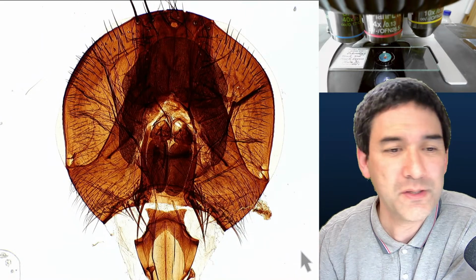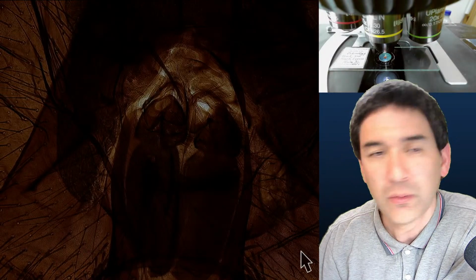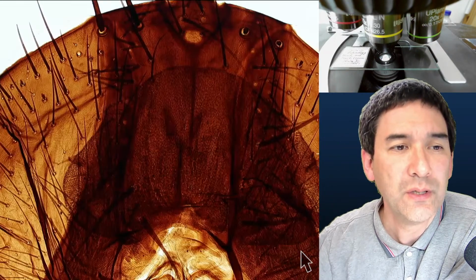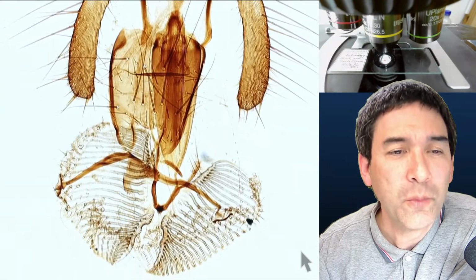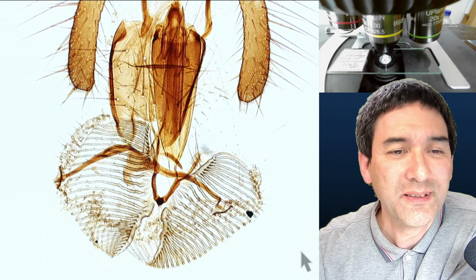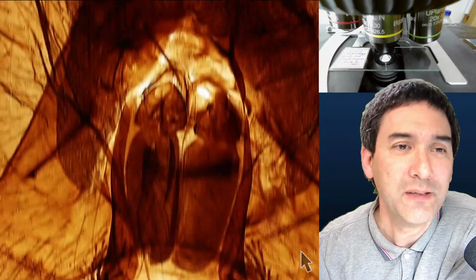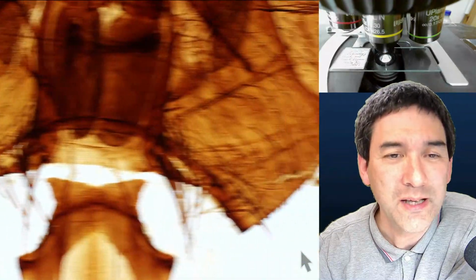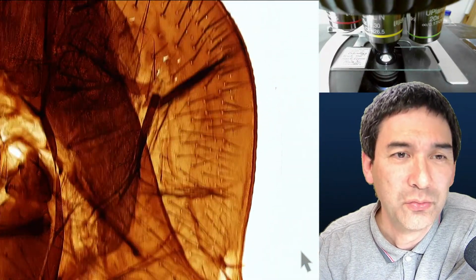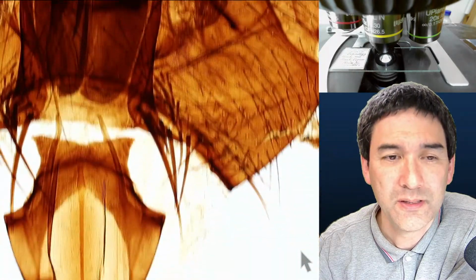Yeah, we can actually go a little bit up with the magnification, and I will. So this is now with a condenser. Look, it always fascinates me, the enormous complexity and intricacies of this. That's one thing that fascinates me, and the other thing is that the quality of the slide is so good, because those folks who made those slides around 100 years ago really put a lot of work into those. So it's really, really nice.